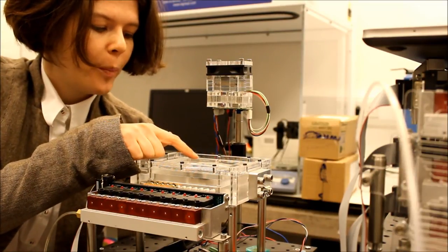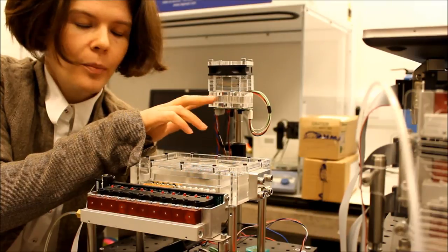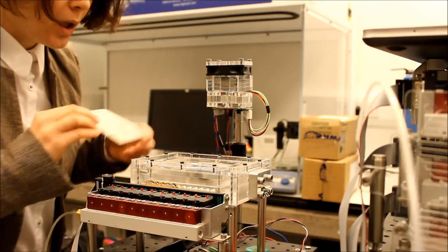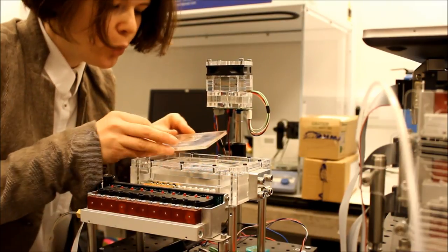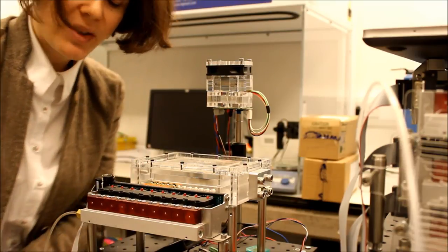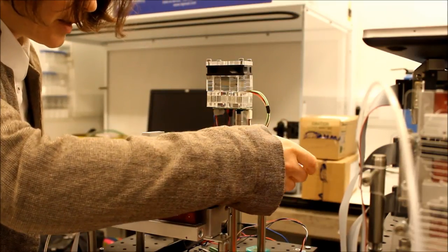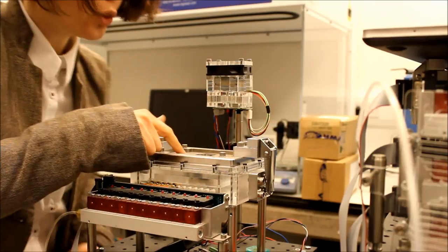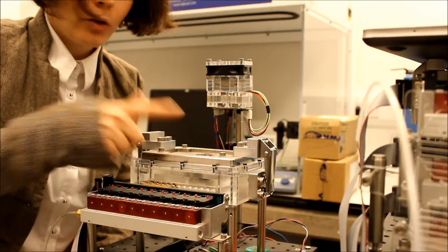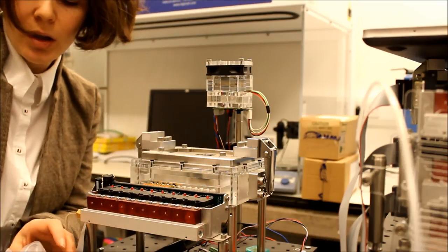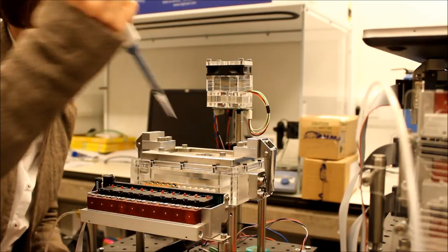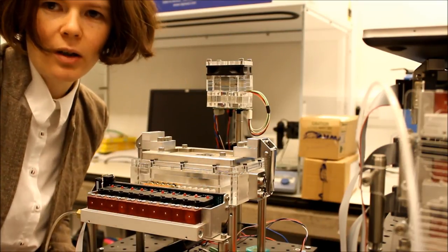Here we have a Peltier and a robotic arm with a magnet. The chip can be placed onto the platform and clamped down. Silicon arrays ensure good connection between the chip and the platform. The chip can then be loaded using a pipette or a robotic arm.